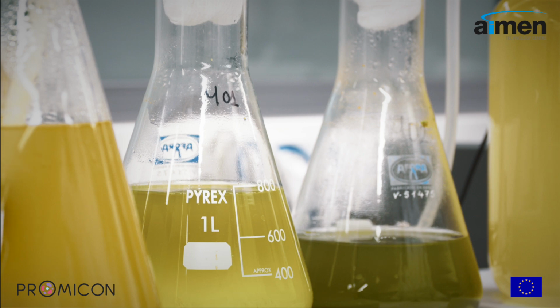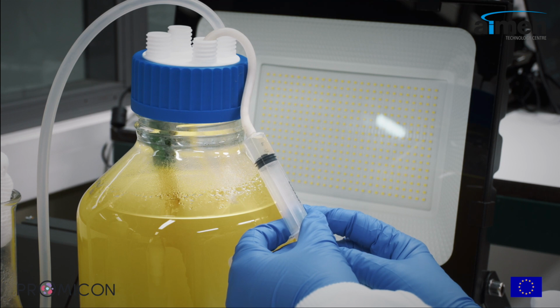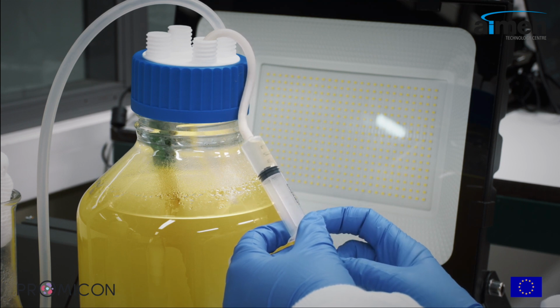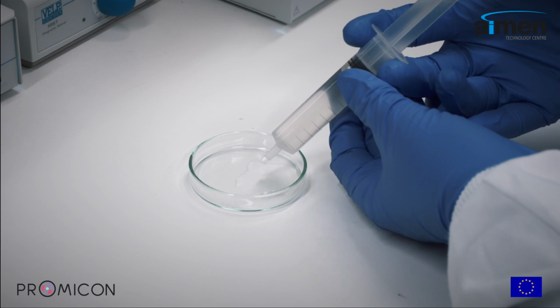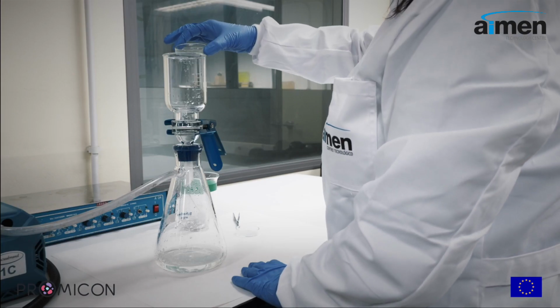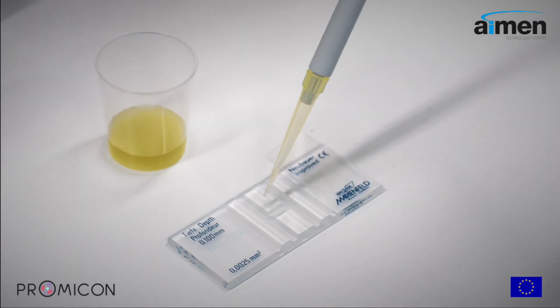To do this measurement, 3 samples a day are taken. Then we undertake laboratory analysis and hyperspectral imaging of these samples. Moreover, to know the ratio between the cyanobacteria and other microorganisms, such as green algae, each sample is analyzed in the microscope.